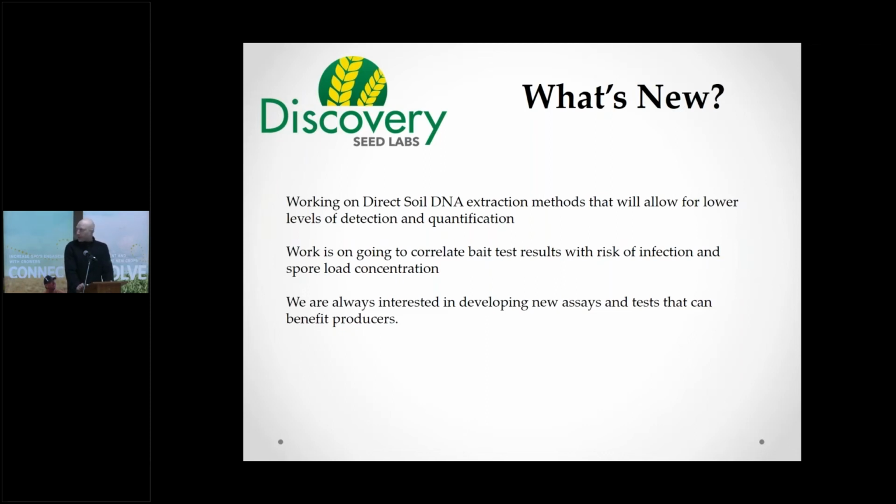We're also working with our bait test to correlate the infection that we see after a week to a spore load in the soil, and trying to convert that back to a risk factor, high, medium or low risk for planting pulses in that field. Right now, the results are just detected or not detected.